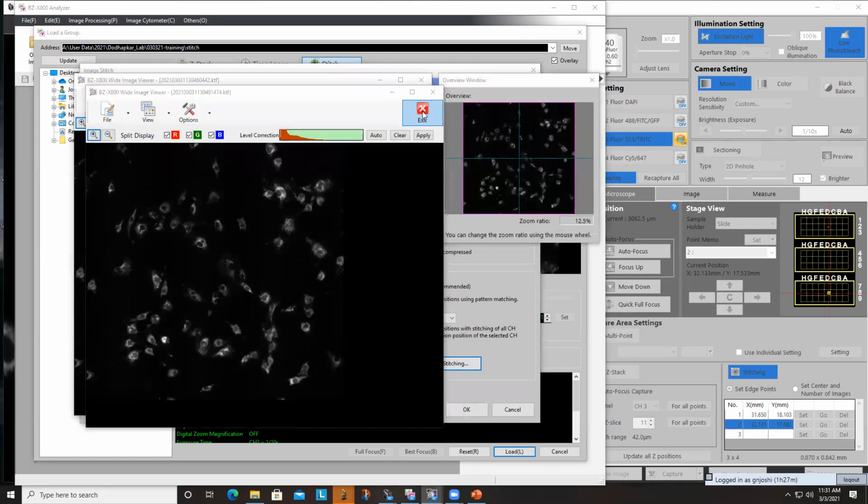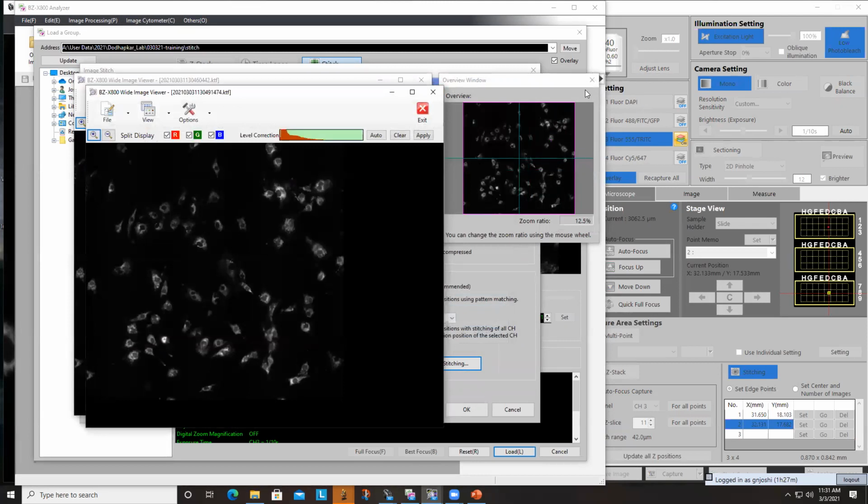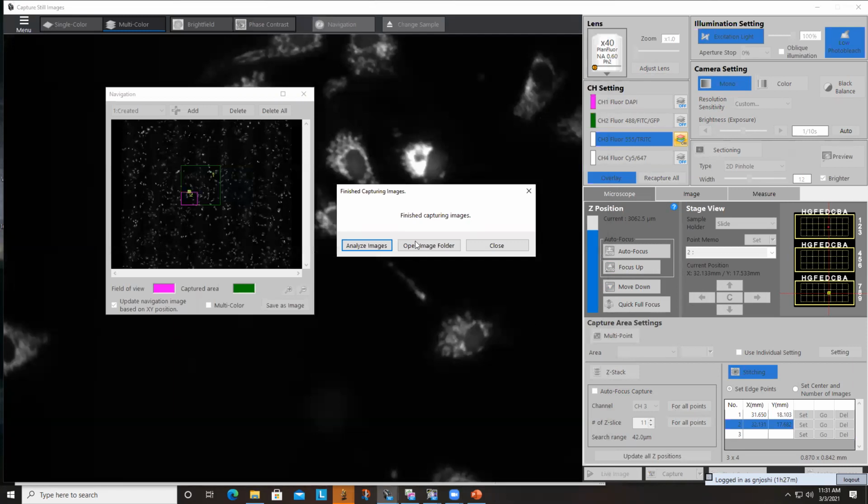I will skip the oil part right now because that's not something that you want to apply to your sample, but tomorrow when you come over here, I'll still let you practice putting the oil and so on. Apart from that, that's pretty much it with this. I will see you tomorrow. And I'll share this video with you, so that if you want to look at something again, you can look at it before you come tomorrow.